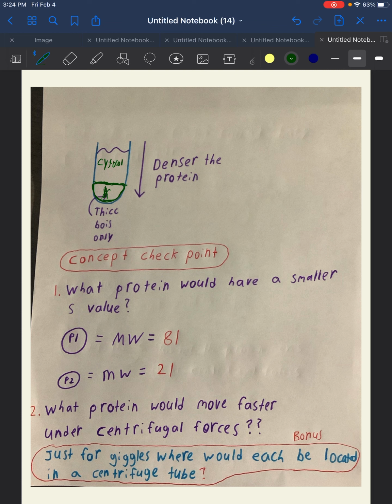And once again, this makes sense because cytosol, which is very liquid-like as the soluble proteins, was at the top, and then that thick, dense, awkwardly shaped cell components such as the mitochondrial fragments, microsomal fragments, and the nuclear fragments were at the bottom because those are way more dense, way more awkwardly shaped. So this all makes sense. It's all starting to tie together. But let's just make sure you guys understand the concepts before I end this video.